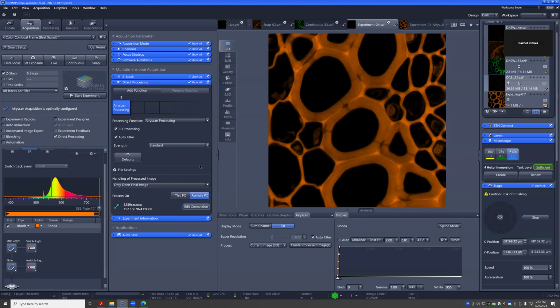So when we set this up, don't turn off the display. Windows has those power setups, so we should turn everything off so it doesn't go to sleep. Right, the monitor, of course, doesn't matter for this. It's good to check, though.